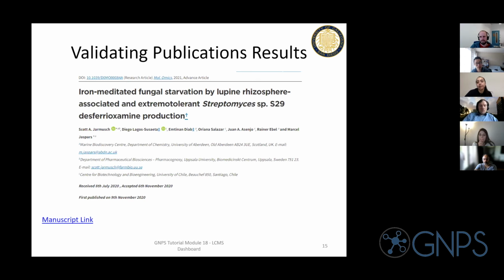As well, if you do XIC on 100 files, we have a reasonably beefy server, but it still chugs a little bit. And then there's another question: can I export the data in a graphical plot or table? Yes. If it shows tabular data, like for the feature finding as well as the integration, those you can export. There's a little export button. For the XICs themselves, we don't have an export button. If that's preferable, just let us know.